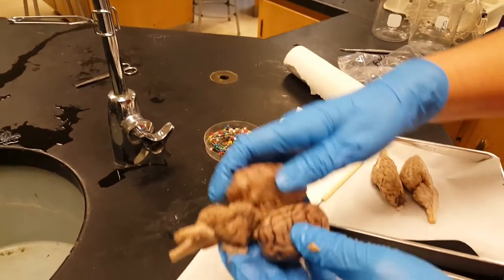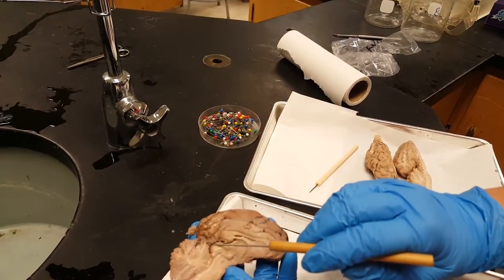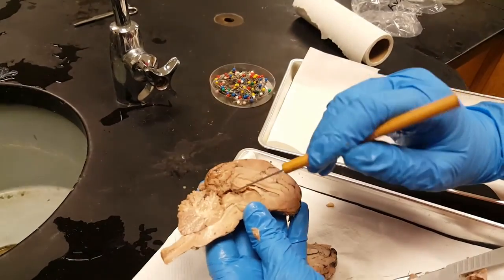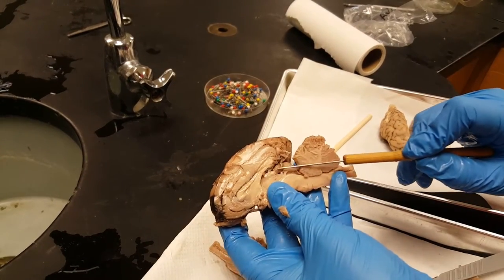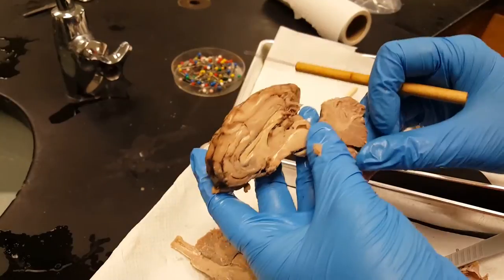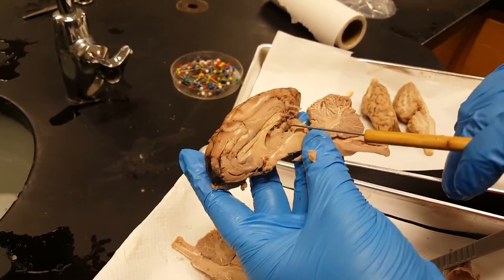You can also see the superior colliculi, inferior colliculi, and pineal gland from the inside. I had to cut it a little bit off center, but you might see it better on this side. Superior colliculi, inferior colliculi, pineal gland.